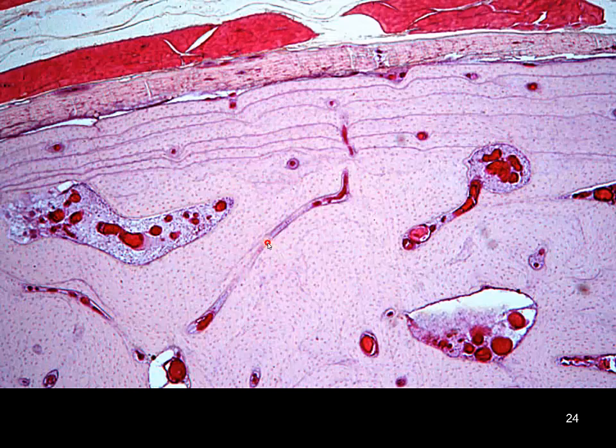So looking at a higher magnification, again, we're looking in the region of our compact bone. We can see our central or Haversian canal systems cutting cross section. But then we also see these perpendicular extensions extending between different Haversian canals. This is a Volkmann's canal running perpendicular. And then here we have basically the cementing lines of our circumferential lamellae, those plates that go around the edge of the bone before we get into our osteons.